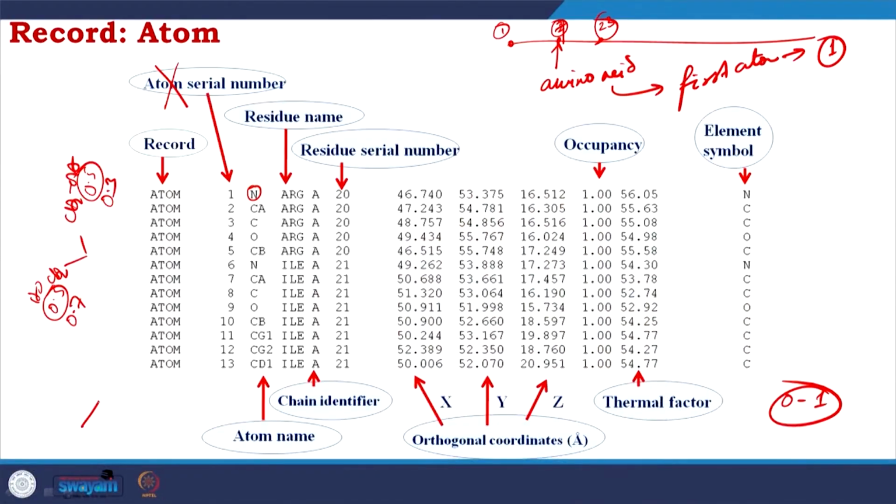What I mean is, if your protein's amino acid has conformation A here and conformation B here, it should go from A to B or come from B to A.